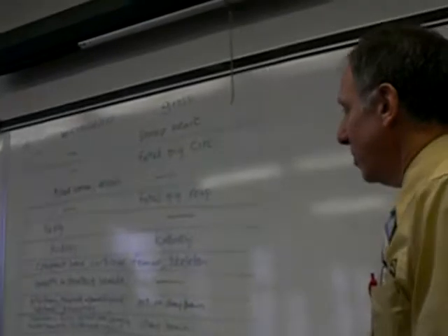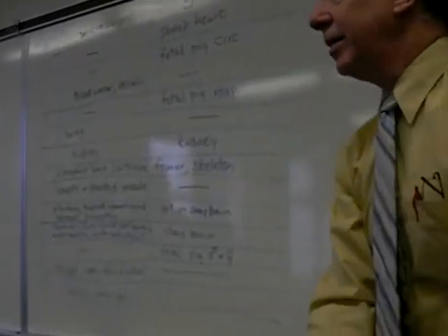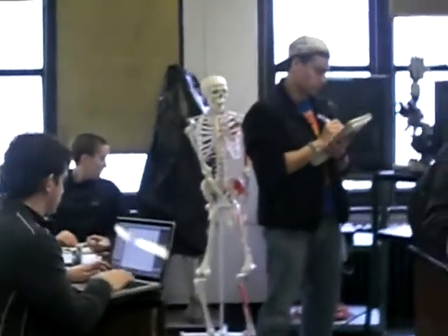16 was the cross-section of compact bone, called ground bone, but the tissue is compact bone, tissue type, and cartilage. On the gross specimen side of chapter 16, we have the actual hemisected femur, and also the full-scale model of the skeleton. That's what would appear on the final. I probably would have just the full-scale model of the skeleton.